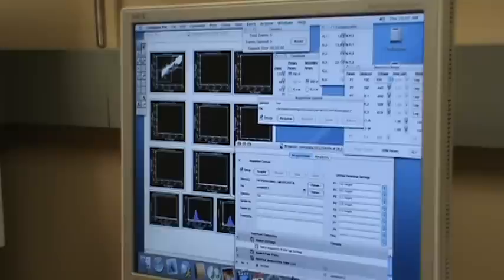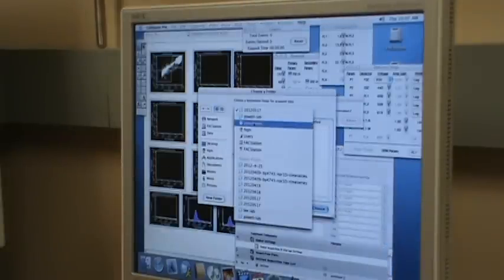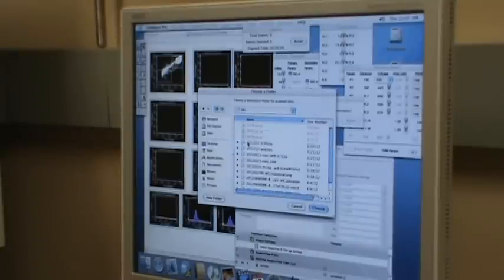So I'm going to change the directory. Save everything in the lab. That's by default, that's our lab. Sometimes you see Lee lab, Howard. Sometimes I also run samples for other people, so I put them in a different directory. So all of us should put in lab.